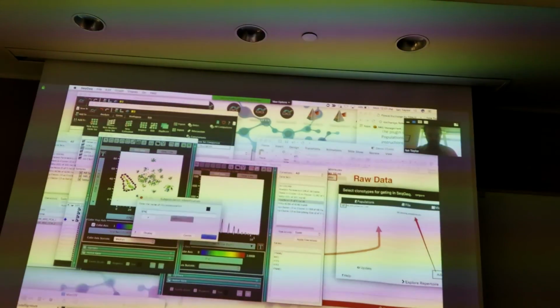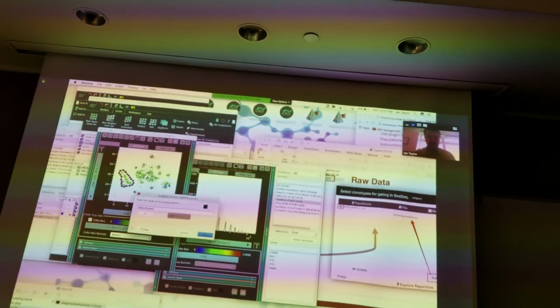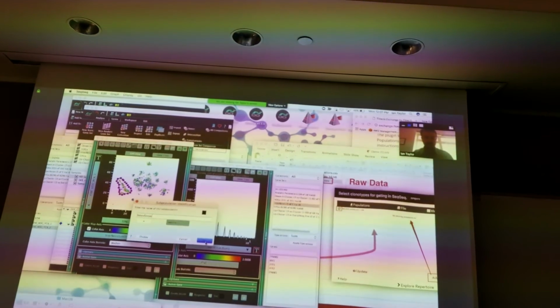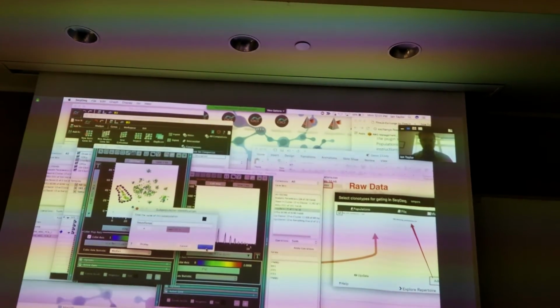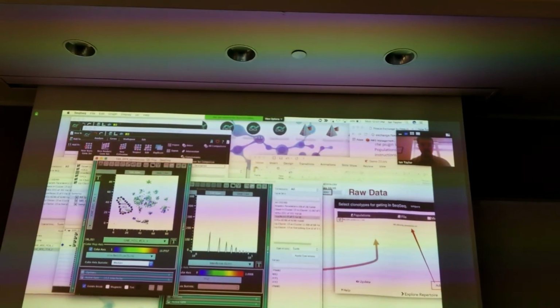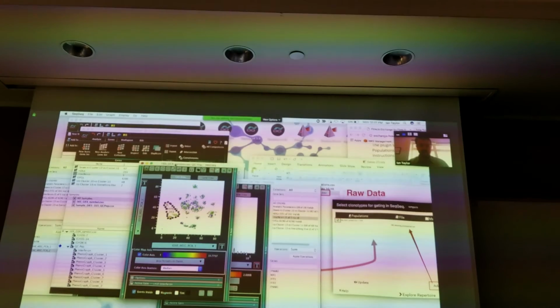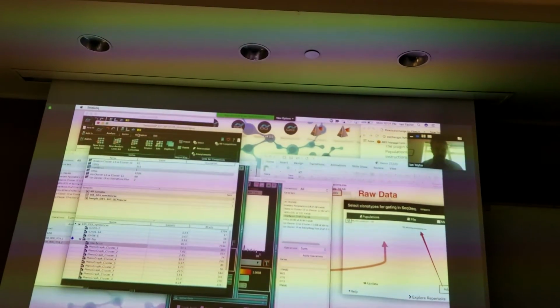Okay. It'd be more interesting to draw a density plot. Remember all the stuff that showed VDJ expression, which is on the top right-hand side, minus those others? Kind of circle those first, and that creates that gate. Double click on it, you're down in just those events. Then you can do the same thing, heat map across that, and isolate the region. If we're not interested in this island and we want only the other cells, this is where a NOT gate comes in handy.